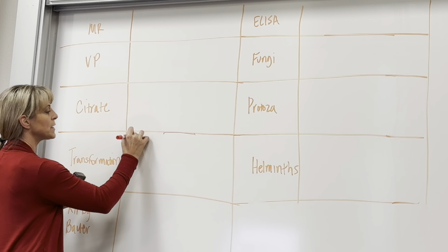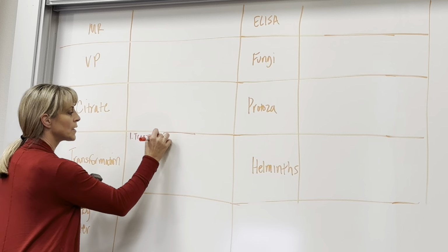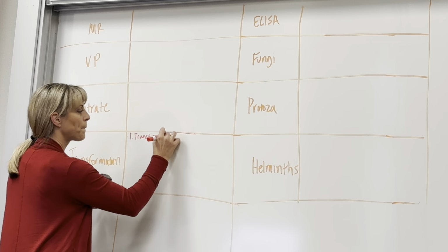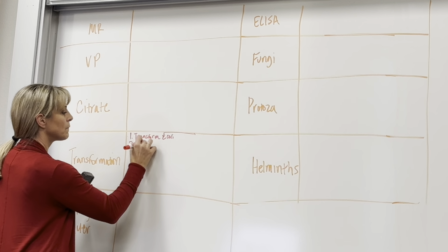Okay, so one, purpose: to transform E. coli. Two, organism: E. coli.